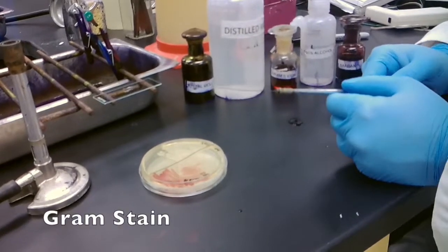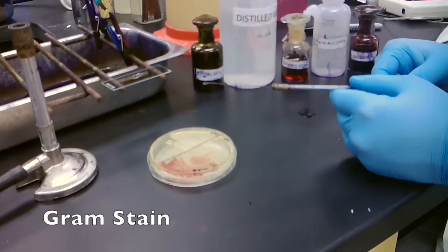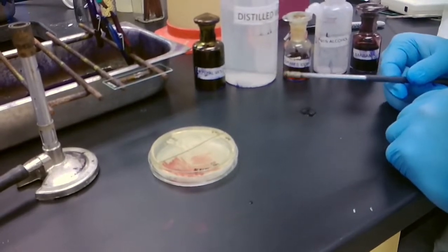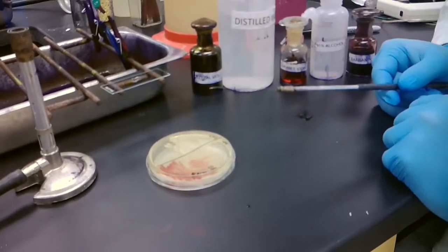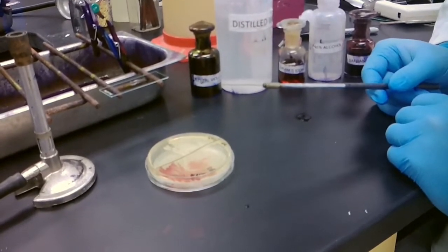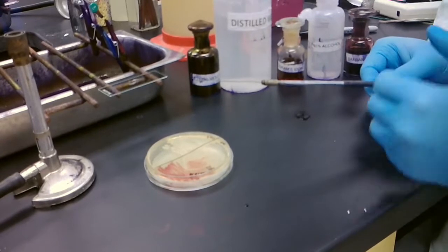So right now what we'll be doing is a gram stain. As you've probably learned in lecture or looking through your lab manual, the purpose of the gram stain is to describe bacteria based on their outer membrane.